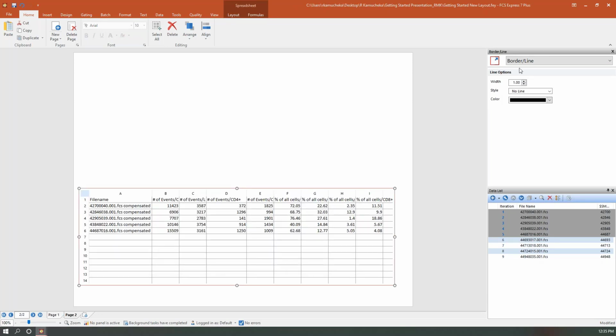And now I'm going to look at my formatting tab. In my formatting tab under spreadsheet data, I'm going to check this box to use values in first row as labels. It just cuts out that step so I'm not having to worry about what is being labeled on my axis.